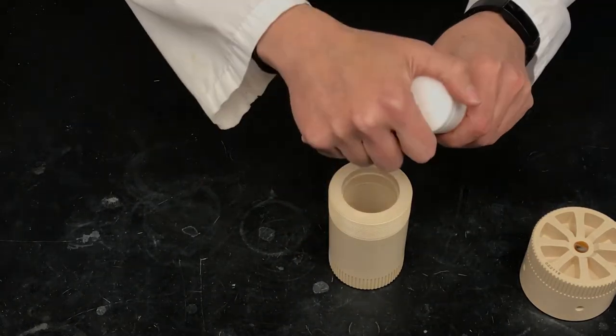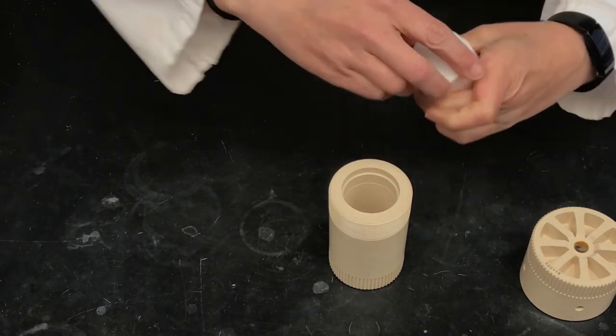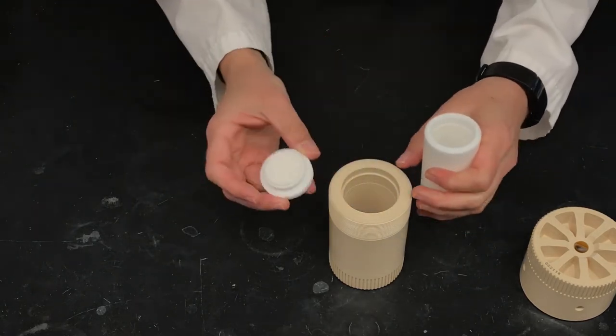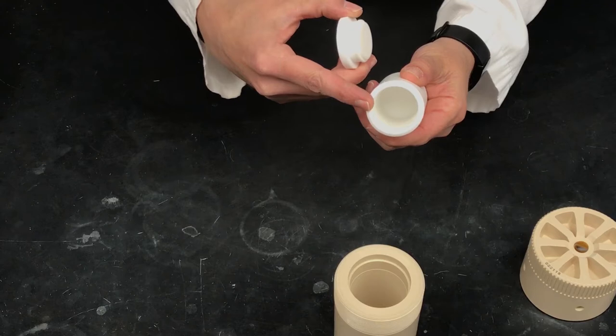And the PTFE cup opens. There's just an O-ring. Pop this open. It's a lot easier once you've heated it up. But in here is where you're going to put your soil sample.